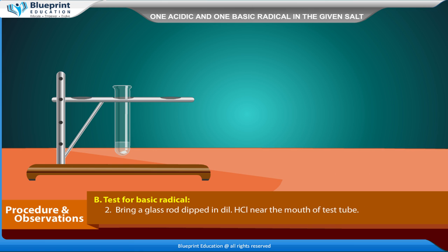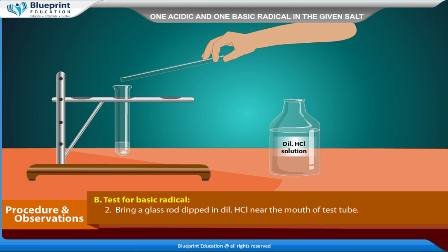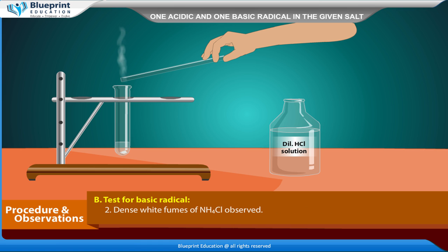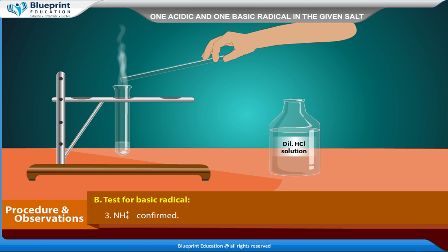Bring a glass rod dipped in dilute HCl near the mouth of the test tube. Dense white fumes of NH₄Cl are observed. NH₄⁺ confirmed.